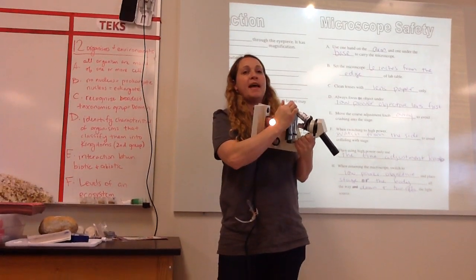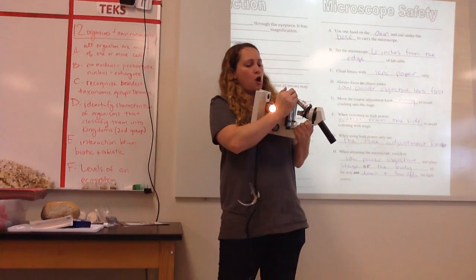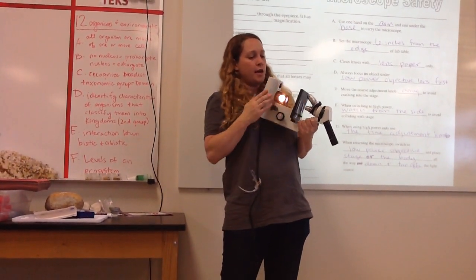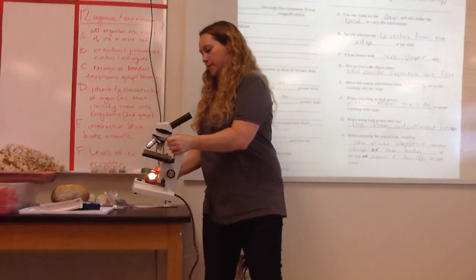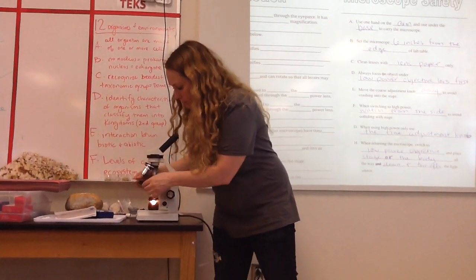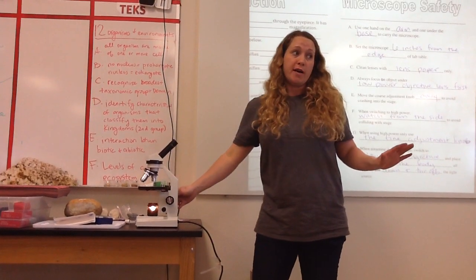So I'm looking, and it was set in the middle. No light was going through, so that's why it looked black. So I'm going to set it to a medium-sized hole. I heard it click. I'm looking, and the light can be seen through it. So that means it's good to go. All right. Put it back safely. Now that it's stable, I can put the slide back on. I'm all the way raised. Now I'm pretty ready to get it to work.